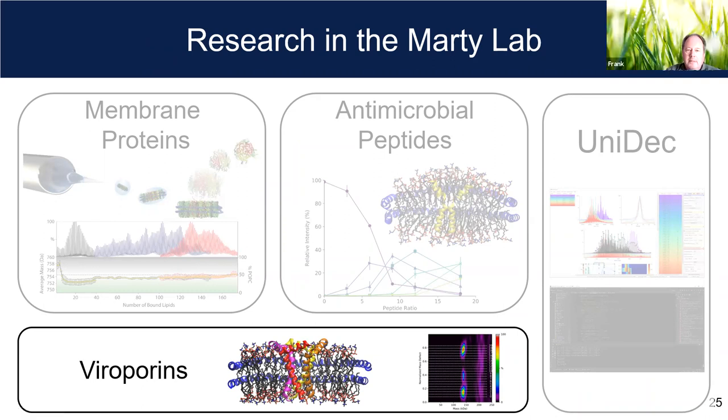Sorry, I did have another one, and I'm not sure if you will touch upon this, but you've also worked with these really nice, more mixed nanodiscs where you have different lipids. Maybe you're coming to this now, but a more simple question: did you find any compositions which the nanodiscs don't like to accommodate, or where they're demixing or something like that? I'm pretty sure there will be. Yeah, we would have had that paper published a year earlier if all of the compositions we tried worked. We found by far the hardest lipid to work with is PE.